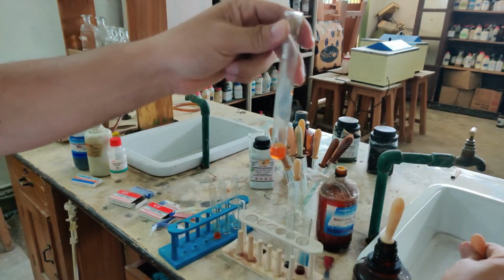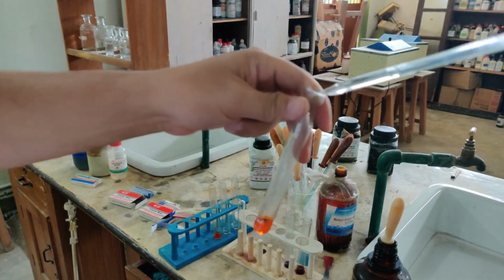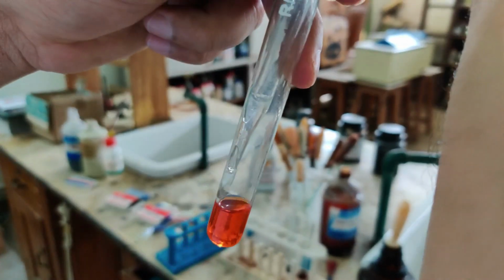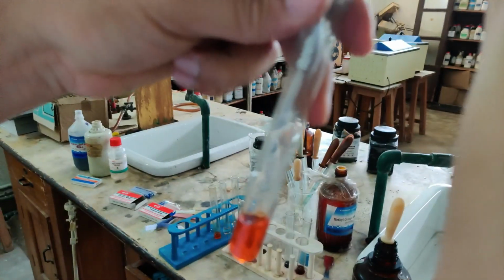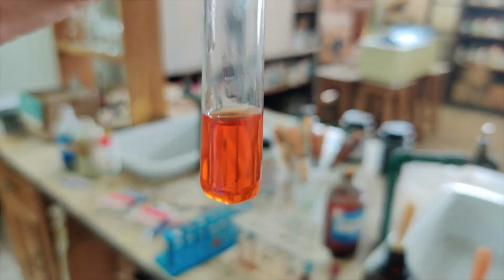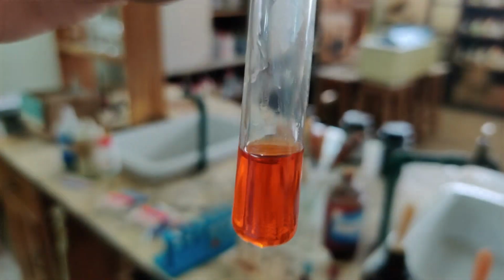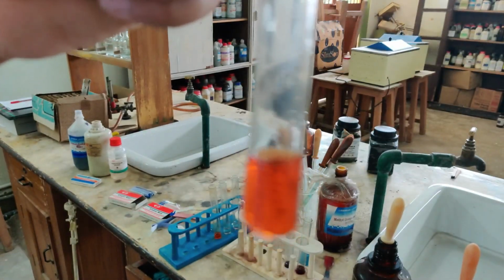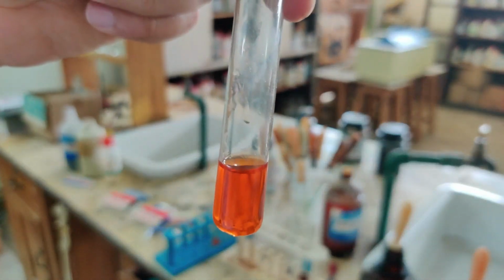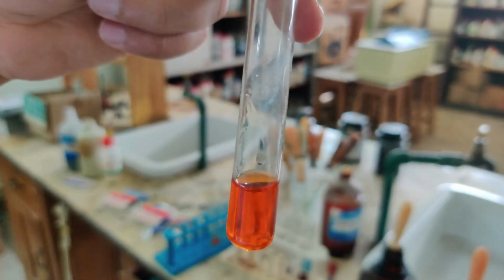Let's see now. I am going to add now dilute hydrochloric acid. Here it is. Now if I am adding dilute hydrochloric acid, you can see it has changed the color. The color change which has taken place has slightly become different from what it was before. Previously it was yellow. Now you know it has slightly become pink in color. Let me autofocus it. Slightly pink in color. So this is how your methyl orange turns to pink in acidic solution.